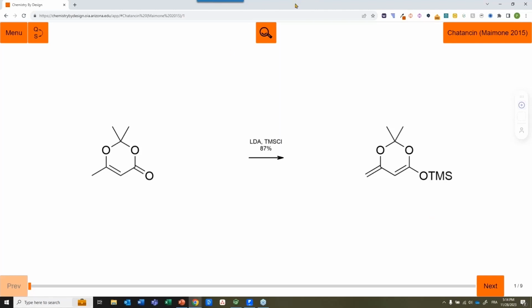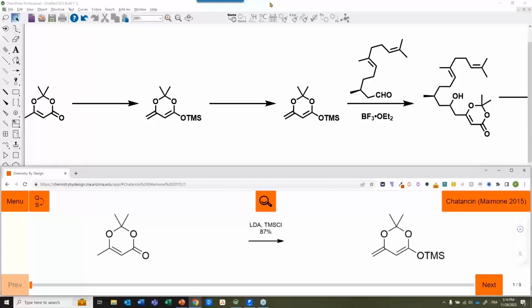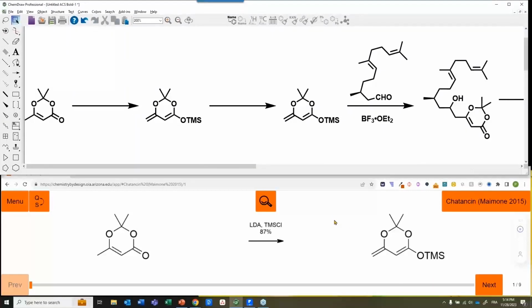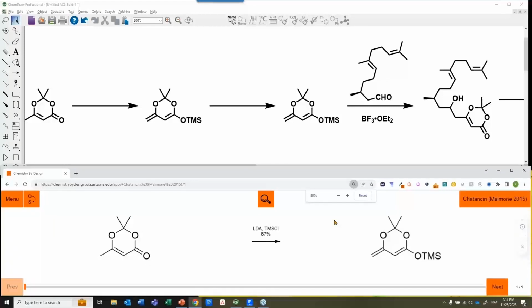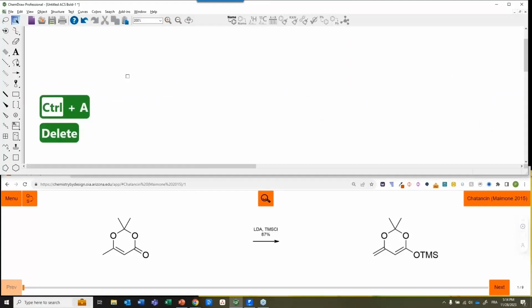I did try to figure out the best way to do this, because I can't do it by heart, by memory. It's also for you to see what I'm actually doing. So we're going to split the screen in two like that. I think I just need to zoom out a little bit for some of the intermediates so that it's seen. Okay, and then you should be able to see things. I'm going to do Control A and delete.